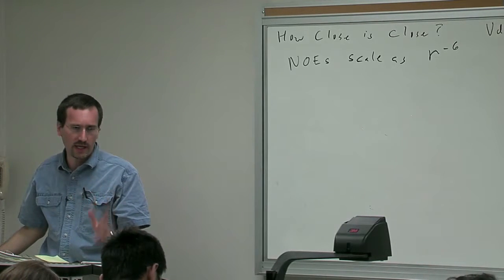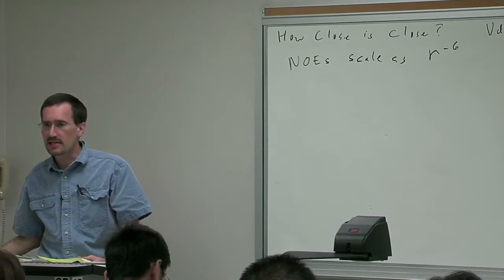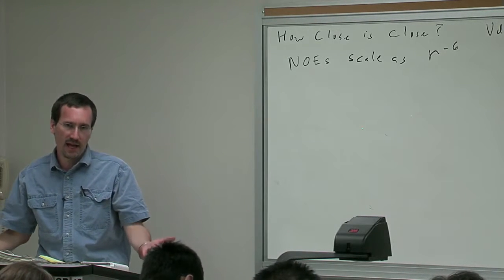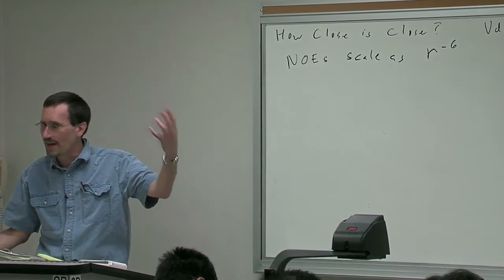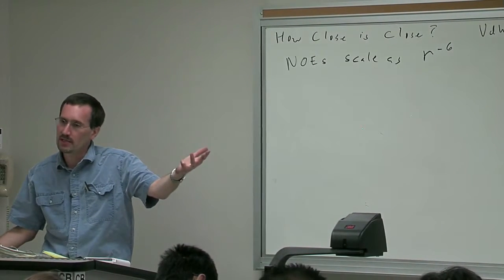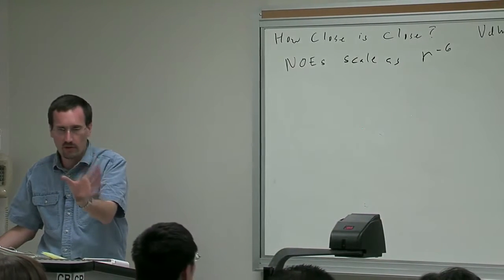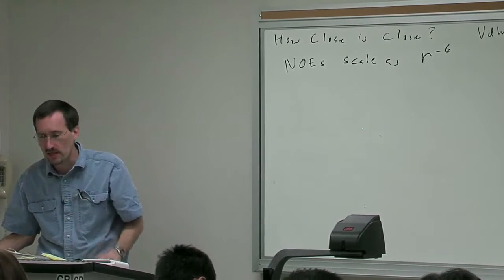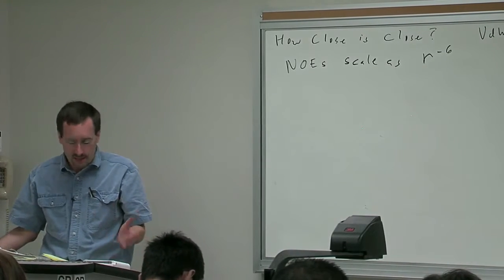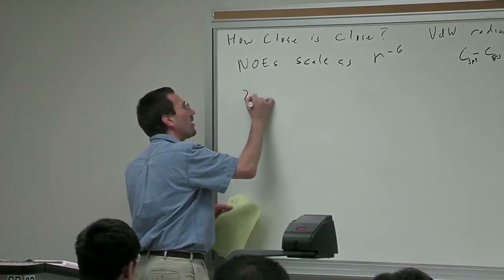When we were talking last time about dynamic effects in NMR, I said, all right, what's 10 kilocalories per mole? Well, 10 kilocalories per mole becomes slow at negative 50 degrees C. 15 is kind of at room temperature, right about the crossover. 20, or a hair less than 20, is sort of crossing over at 100. And we can do similar things here. So let me calibrate myself.